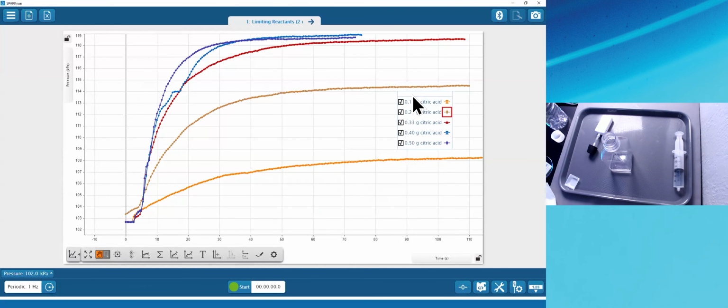So the question was, can we do a delta for each curve and save it? Yes. So first I want to do the orange run. So I'm going to pick the coordinate point tool. Let's do a delta there. We're just going to do a couple. So there's that. There's a delta 5.5.